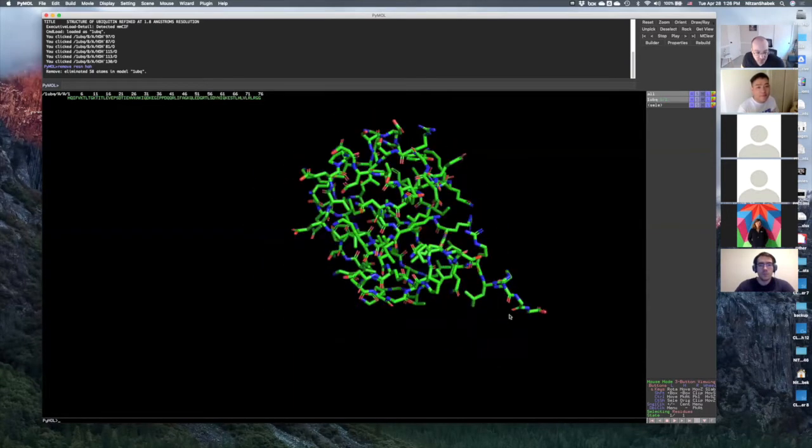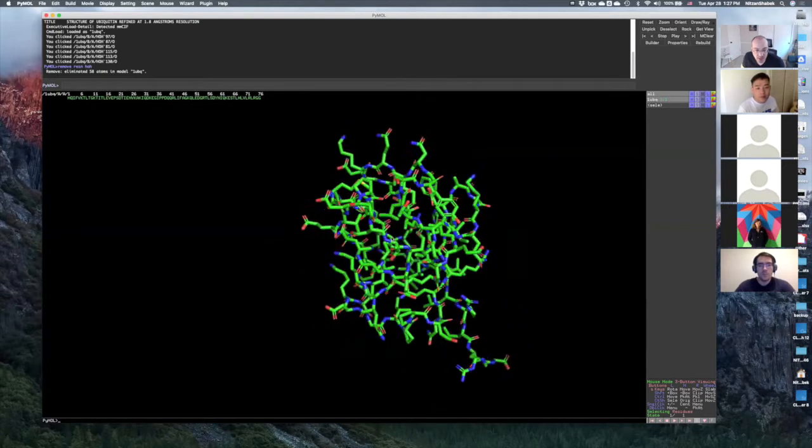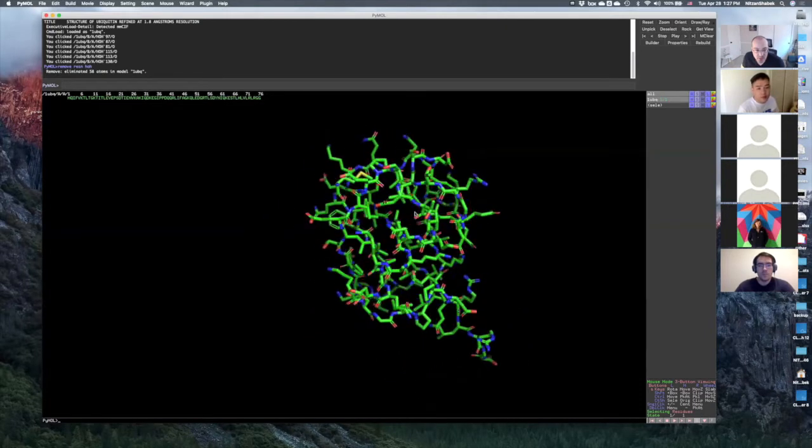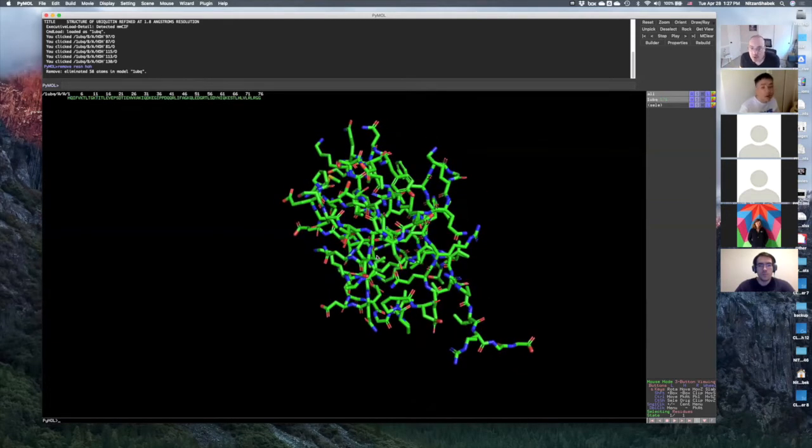Now that's kind of cool. And we can learn a lot from that if we're interested in certain parts, right? But what I want you to do now is select only a few amino acids, and we're going to create a selection. There are a few ways to do it. I want to show you the GUI way, the friendly way, and I want to show you the way to do it in command.